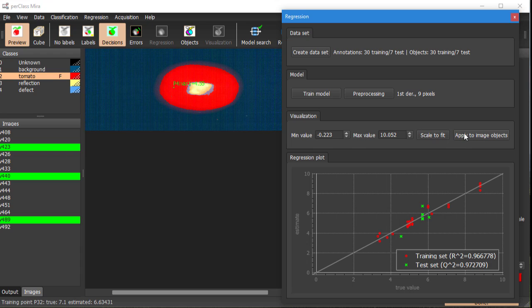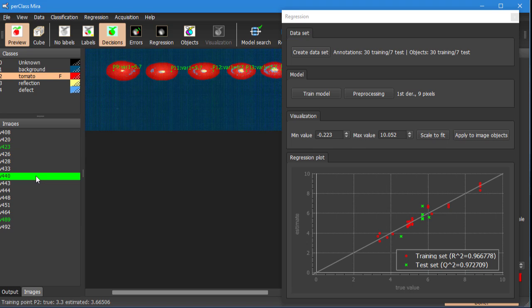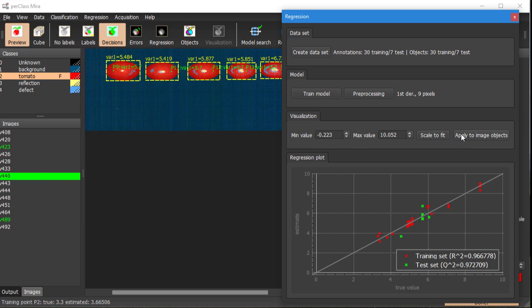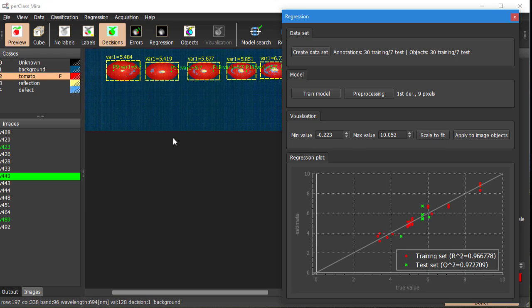We can apply it to any scan. That means that the pixel classifier will be first applied then the tomato objects will be found and for each of them bricks will be measured. That's one thing that we can do. These images don't need to be annotated in any way.